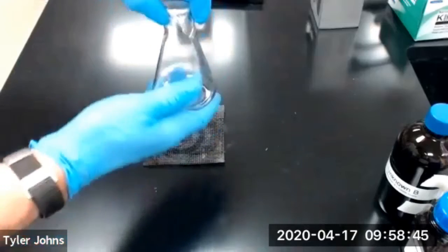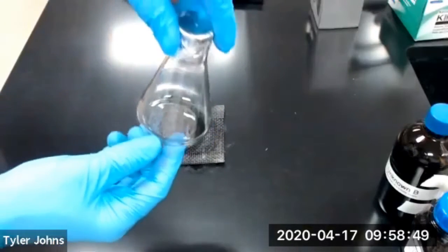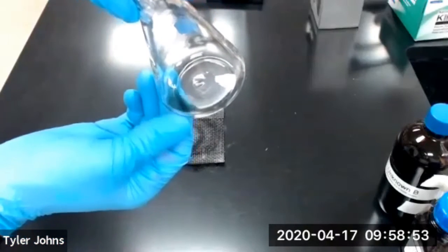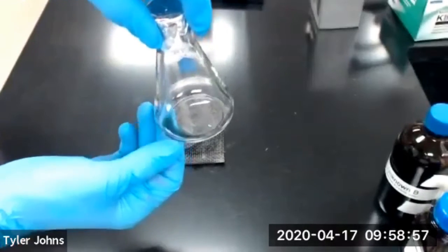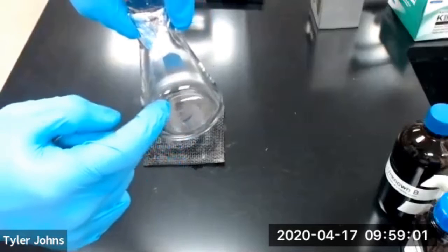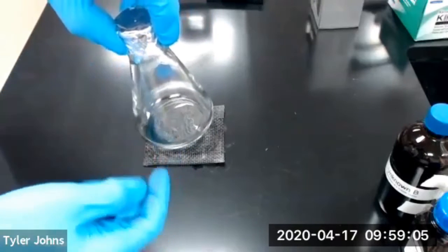We've allowed our 125 mL Erlenmeyer flask to cool, and you can see that we have our recondensed volatile liquid remaining in the 125 mL Erlenmeyer flask. Now we're going to determine the mass of our 125 mL Erlenmeyer flask, the volatile liquid, and our foil lid.